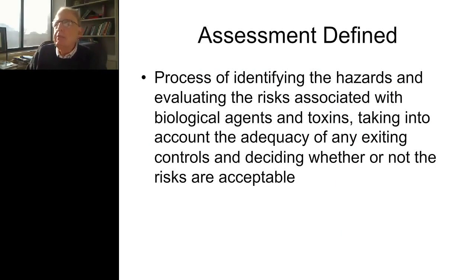Now, assessment can be defined as the process of identifying the hazards and evaluating the risks associated with biological agents and toxins. You need to take into account the adequacy of any existing controls, mitigation factors, and decide whether or not the remaining risks are acceptable.